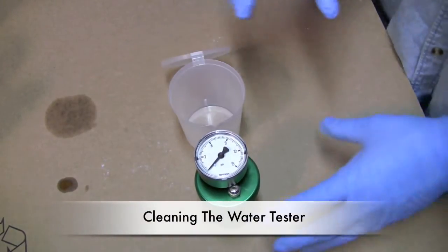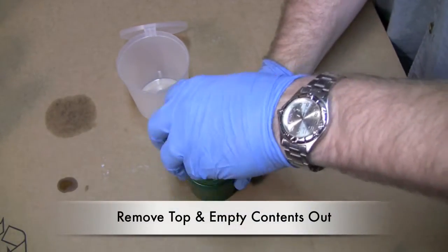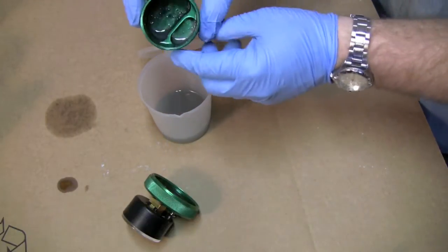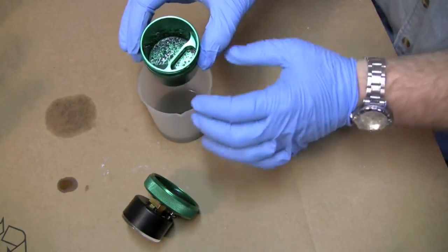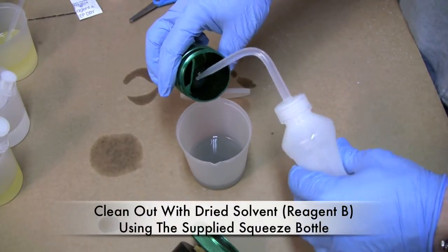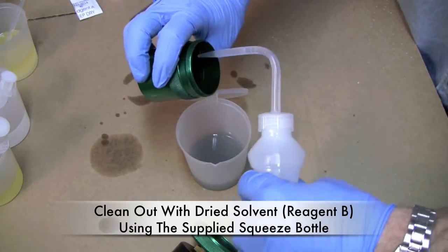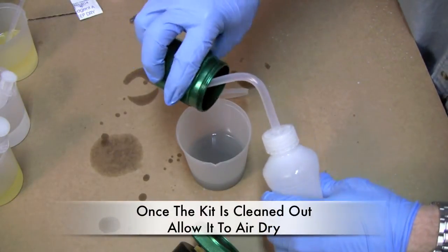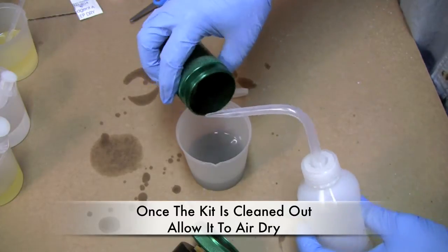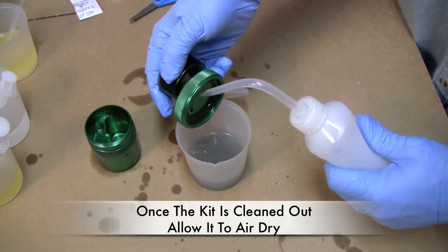We're going to show you how to empty and clean out the kit. Use the pressure relief, then open the kit up, take the top off, and pour the remnants out. As you can see inside the kit there's a lot of residue from the reagent, so we need to clean it out. How you do that is with the cleaning bottle — just spray in here and clean it out over top of a container until it's clean, then let it air dry. It's important not to wash this with water, obviously, because we're testing for water and we don't want water in the kit. The lid is cleaned the same way — just use the squeeze bottle.